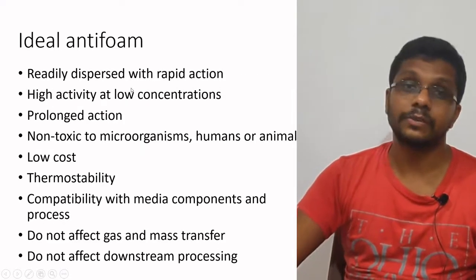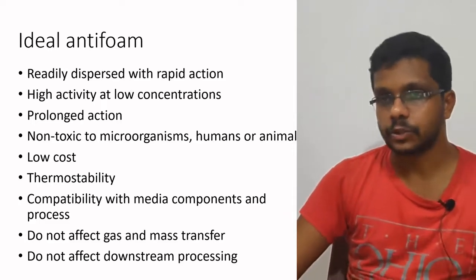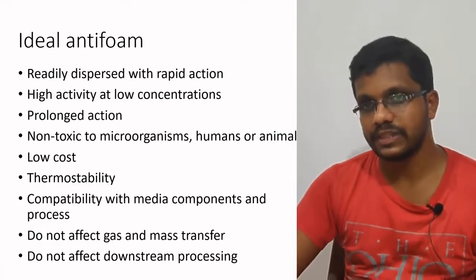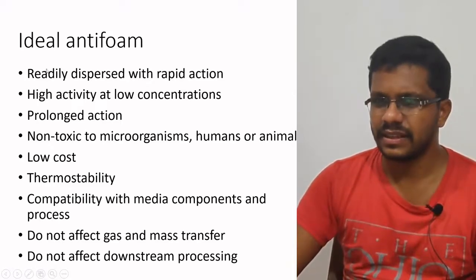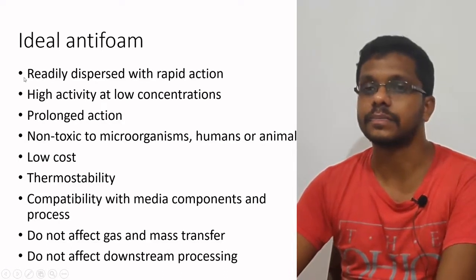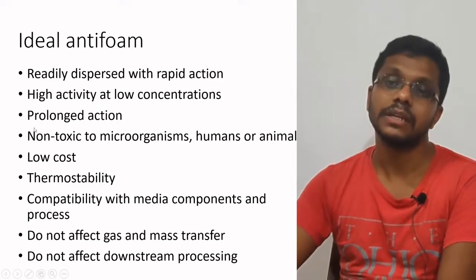Many compounds can be used as antifoam agents, but we are incorporating this chemical into the medium, so we need to consider many things before incorporating an extra chemical into the medium. These are the ideal characters for an antifoam agent. We may not be able to find something with all the ideal characters.